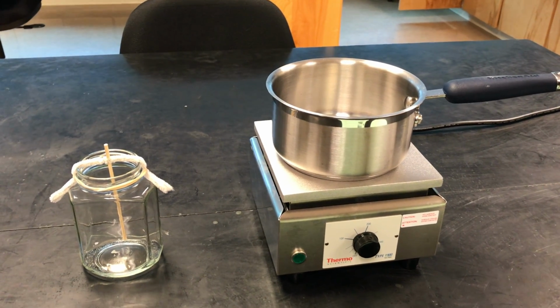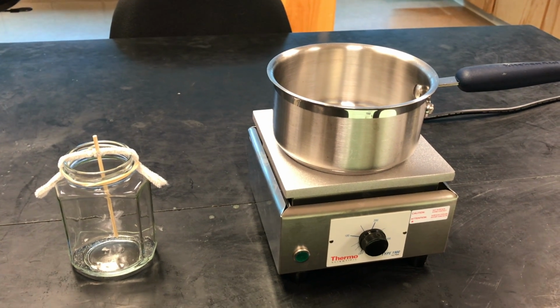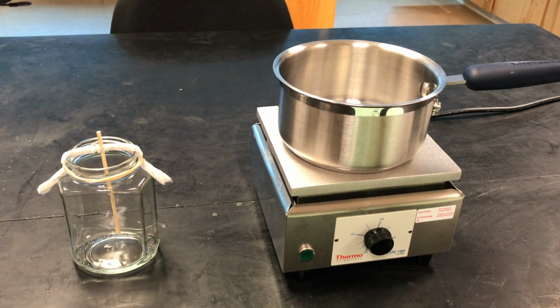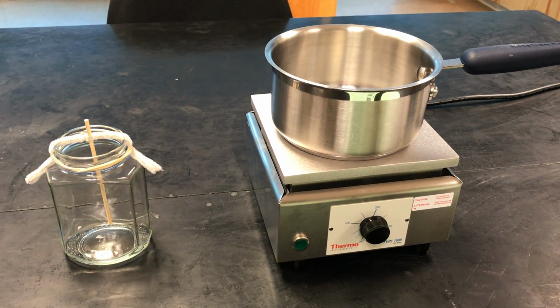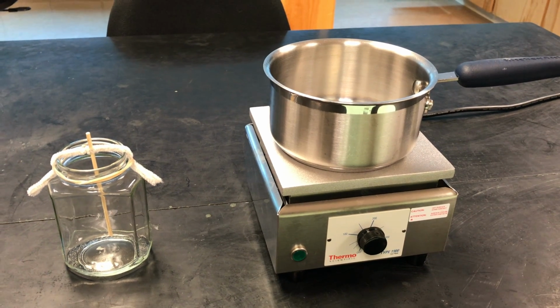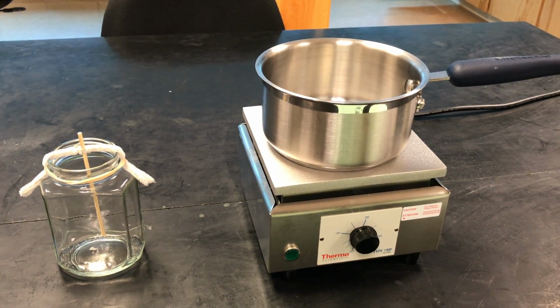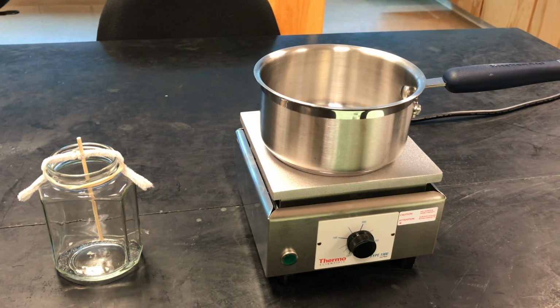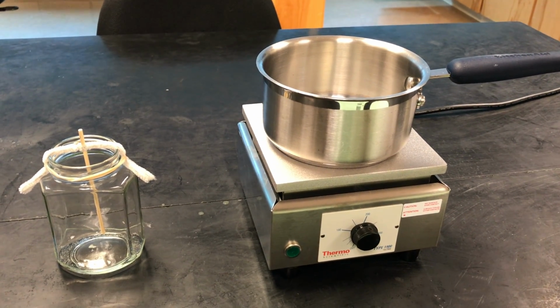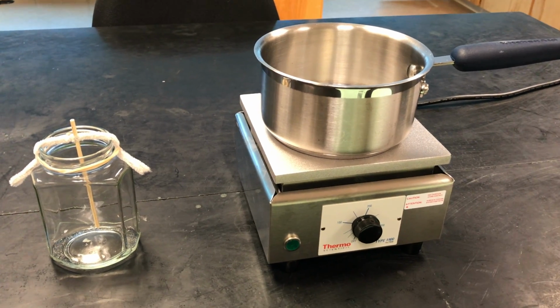I used a bamboo skewer with an elastic and a pipe cleaner, something to allow your crystals to grow in this lab. Might need some tape to affix it. You'll need food coloring if you want to color your crystals. You'll also need a small saucepan and a heating element, so it could be your stove. I've just got a hot plate here in the lab.